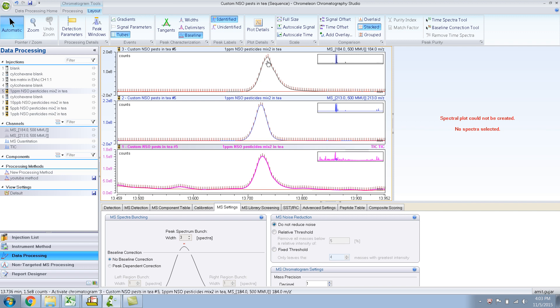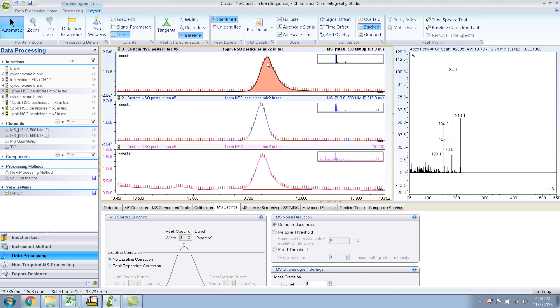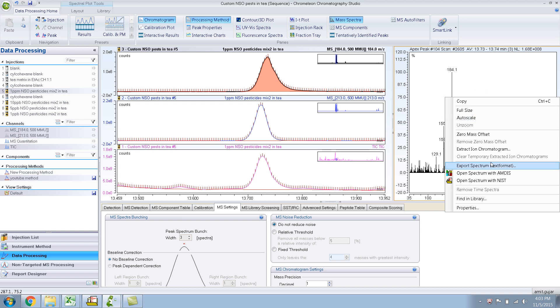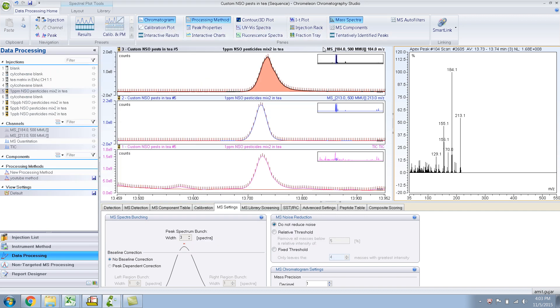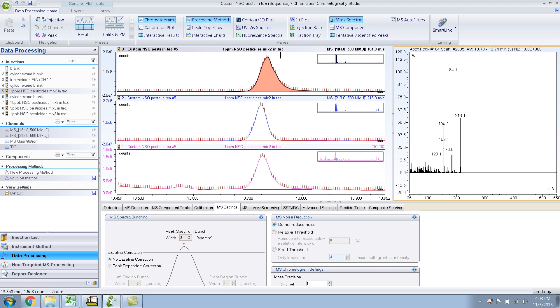So if I click on 184 and I do a library search, it shows me Cymetrin again, but I know for sure it is not. So let me do this. Let me subtract Cymetrin out of this apex, if I can. Let me try.